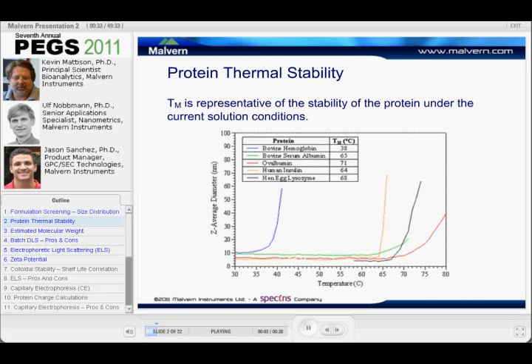Of course, another application for this is melting points, or I guess it's not melting points, it's dynamic light scattering melting points, where you see the onset of unfolding of the protein with a given temperature. You'll see that in the size change shoot up, and this is obviously different for different proteins. So this is just another way to use a quick, easy batch measurement to get another idea about your sample itself. And of course, you can correlate these with DSC, which we'll see later. So it's just another way to get another piece of information out of the measurement you're making.